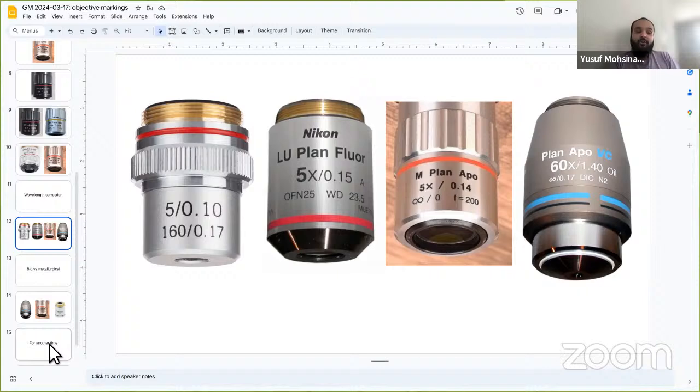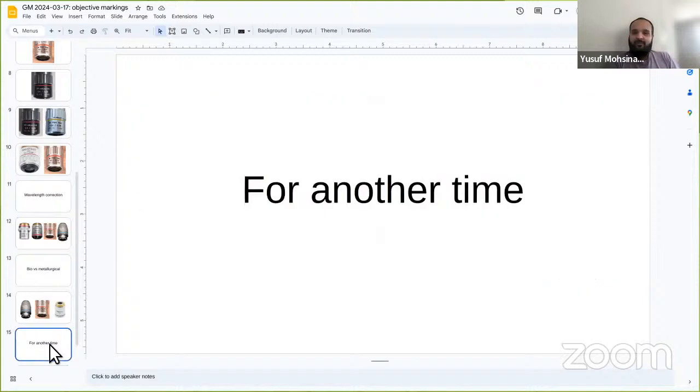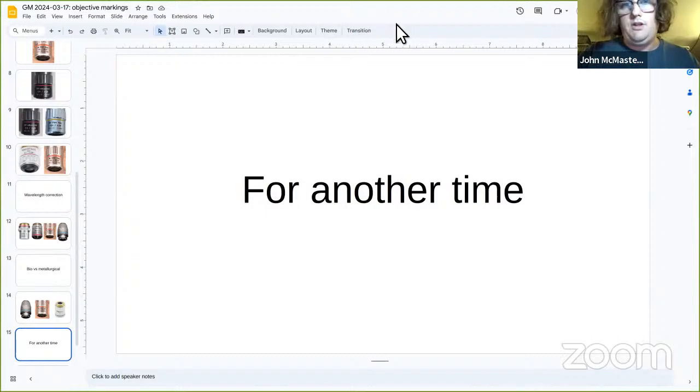Sure. John, we do have a question. I don't know if it's appropriate for this talk, but somebody is asking if you could speak a little about the NIR/UV objectives. Sure. Actually, basically we're done with this, so let me stop share. And specifically what they're used for, etc.